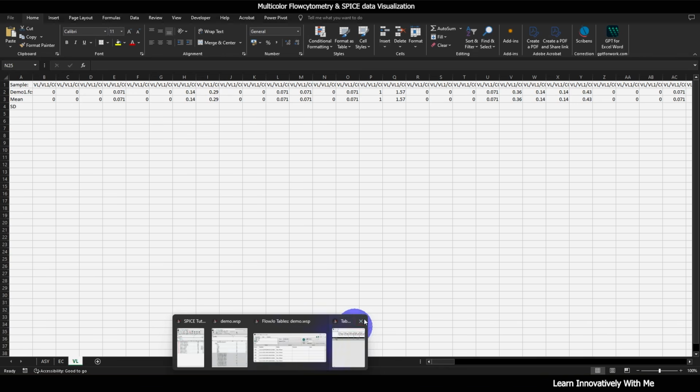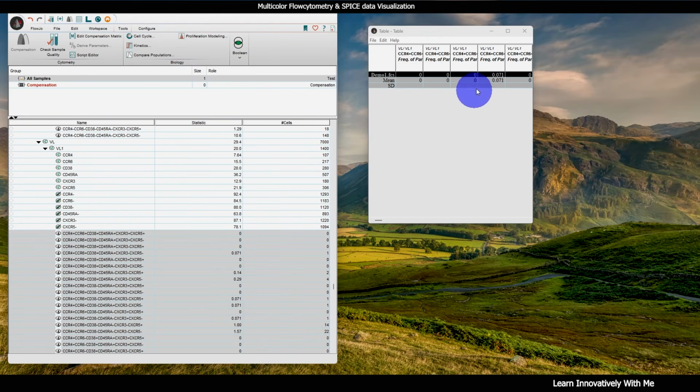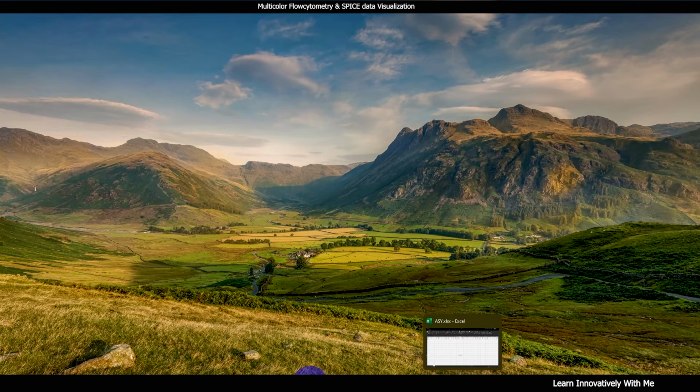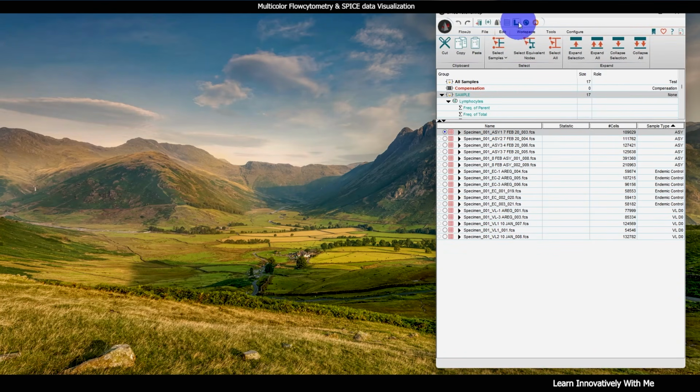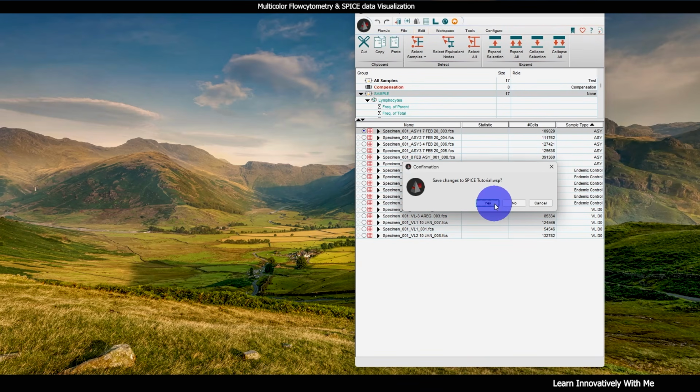So I'm going to close this. The main file also I'm going to close.